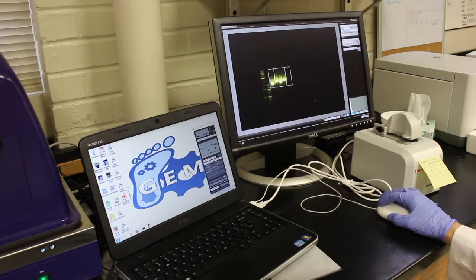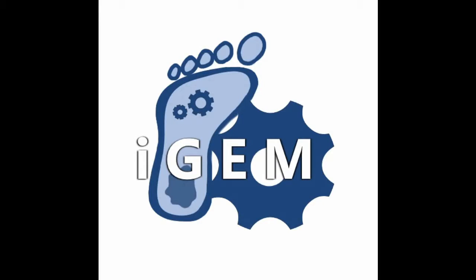Now the gel can be imaged and analyzed. Now that you know how to make and run an agarose gel, you're one step closer to mastering the laboratory. Go forth and discover!